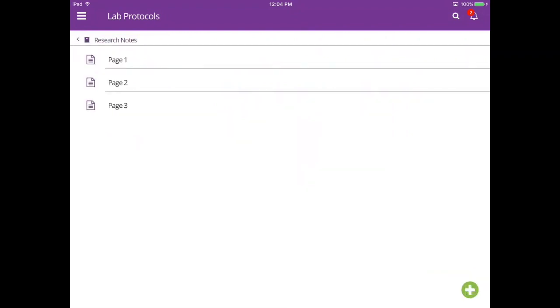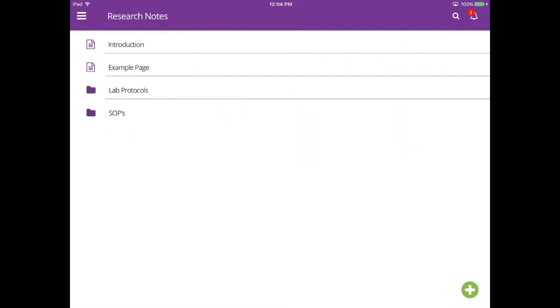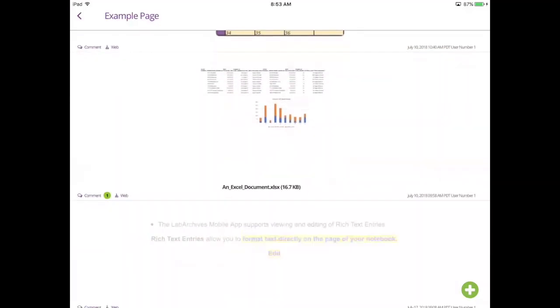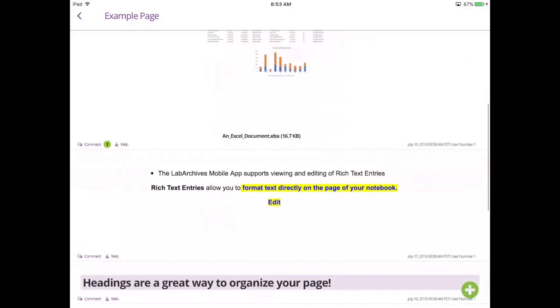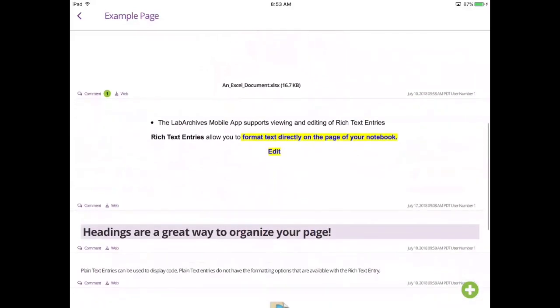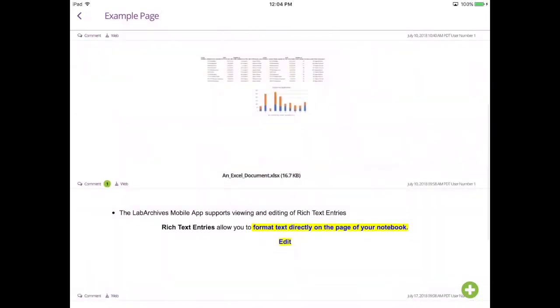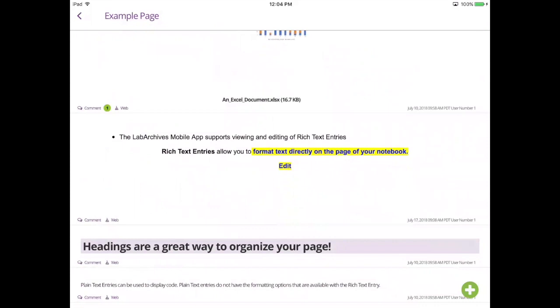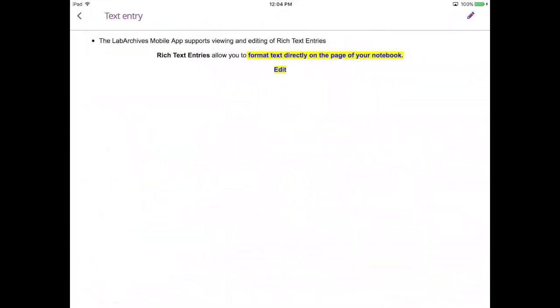To view entries on a page, tap on the page name. By scrolling down the page, you can view thumbnails for all entries in your notebook, including attachments and widgets. To view a single entry, tap on that entry.